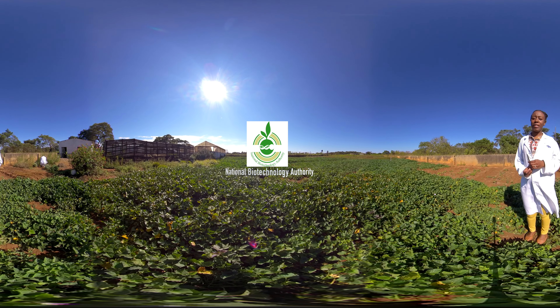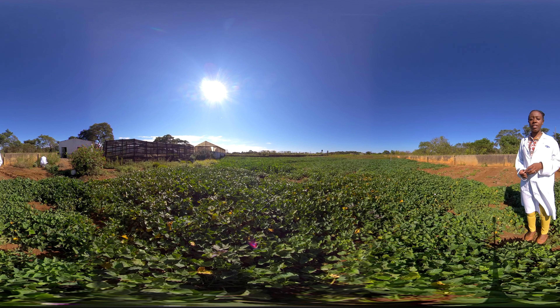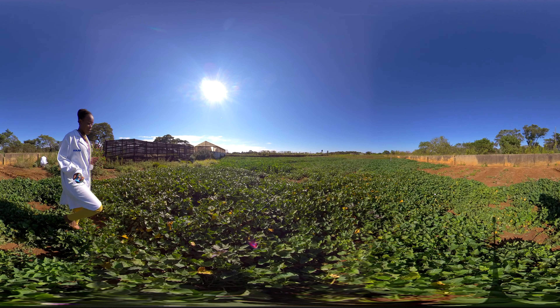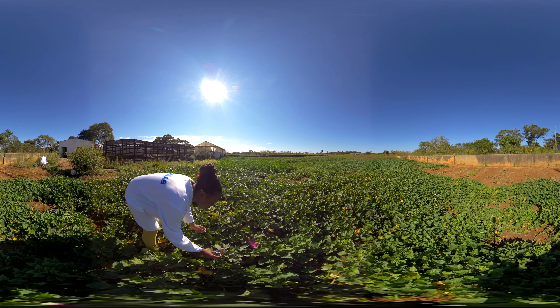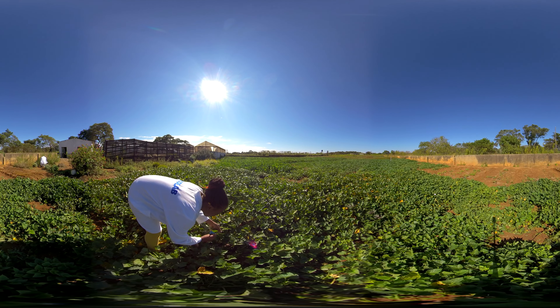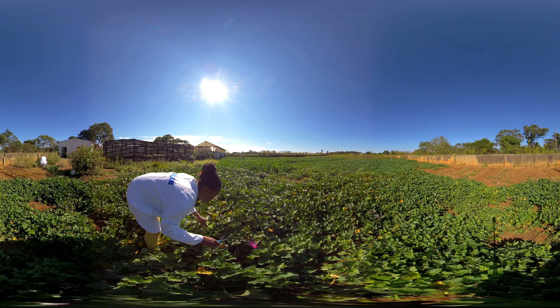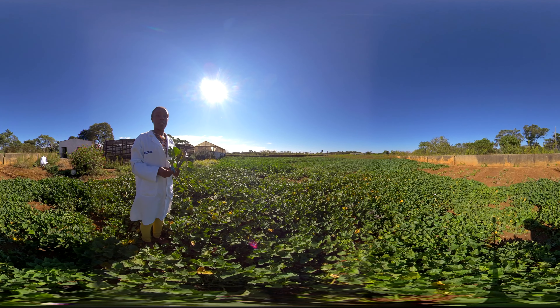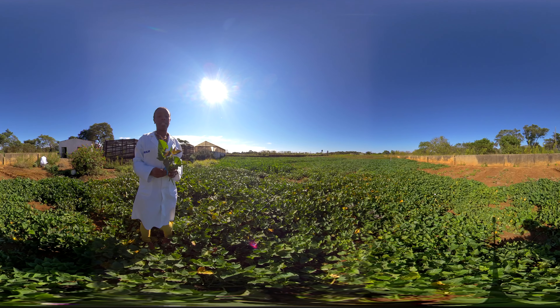I'm Catherine Mukoji. Welcome to the National Biotechnology Authority, where we're conducting a tissue culture project whereby we eliminate viruses from different crops. I am currently in a field of sweet potato plants. If you look all around you, you'll see different varieties of our sweet potato plants. This is where I will collect my planting material, which I'll then use tissue culture techniques to remove the viruses from. Join me in the lab as I show you how to employ these tissue culture techniques to eliminate the viruses.